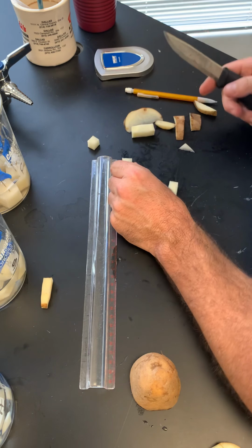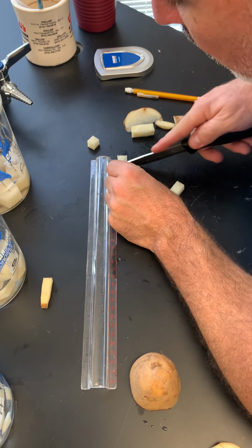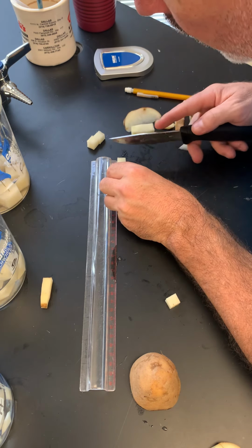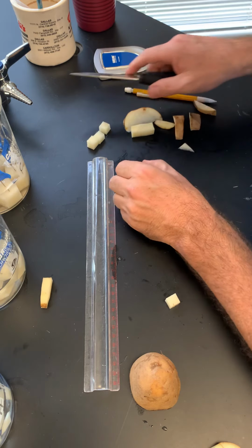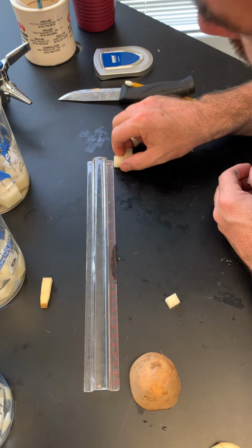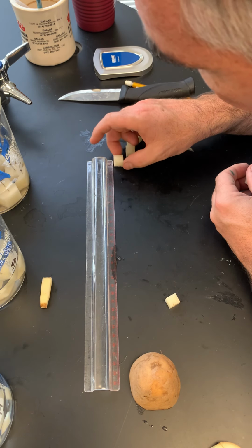That's 1 cubic centimeter. 1 cubic centimeter. That one wasn't quite 1. And that's 1. And that's 1. So all these are the same size, 1 cubic centimeter, no matter how I turn it.